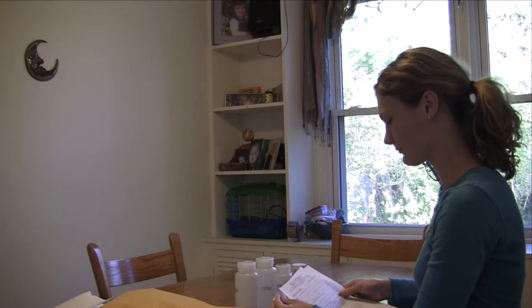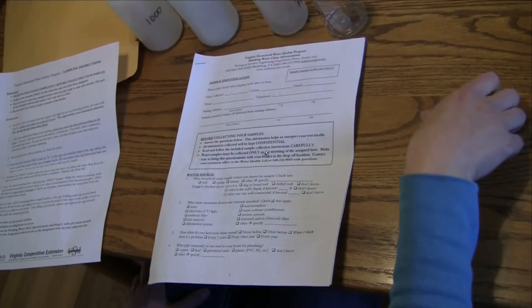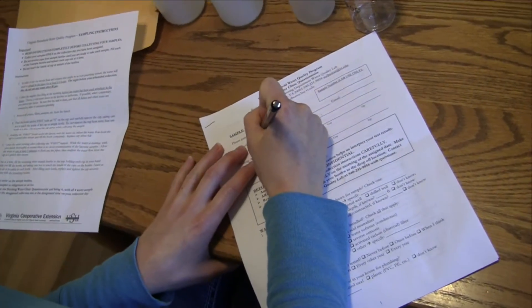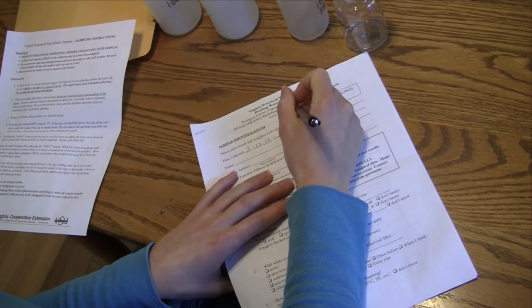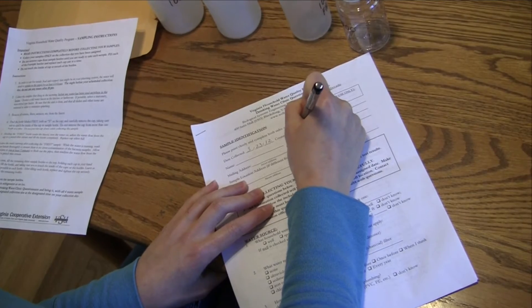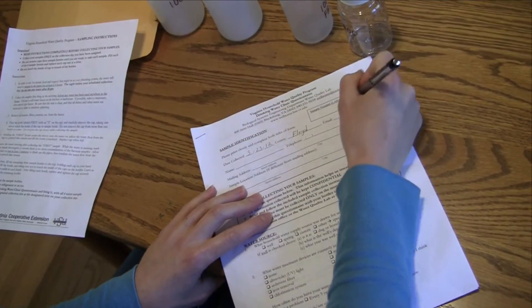In this short video, we'll explain how to collect your samples. Follow instructions carefully. Please take a moment to complete the questionnaire enclosed in your sample kit. Remember that all information is kept strictly confidential.